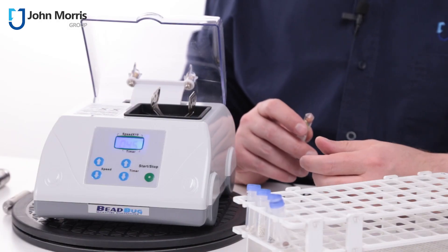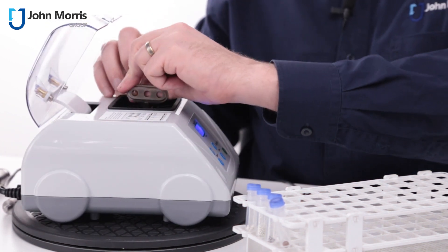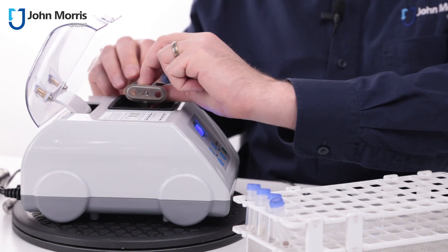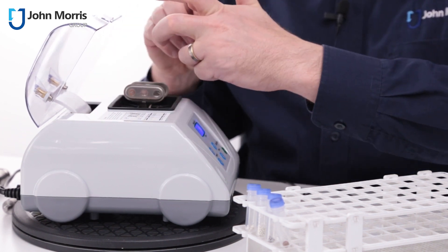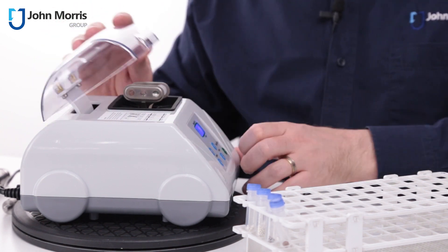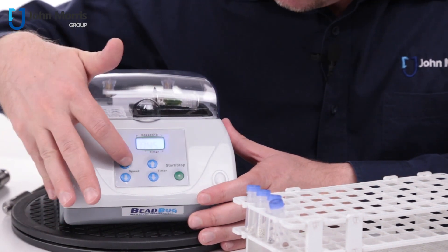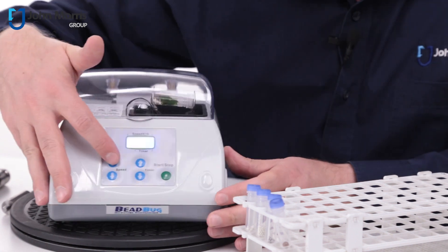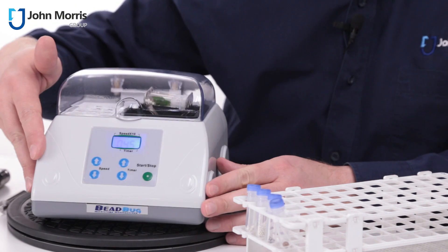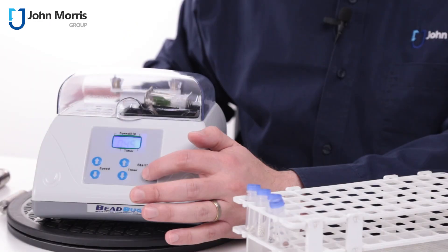Loading the instrument is quite simple. Simply clip them into position and you'll hear a click, then close the lid. Choose your speed and your time. You'll see here that this is currently set to 4,000 RPM and the time is set to 45 seconds. Let's give it a go — to get started just push start.